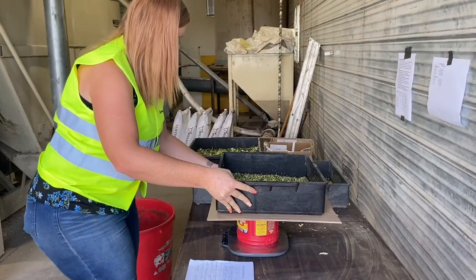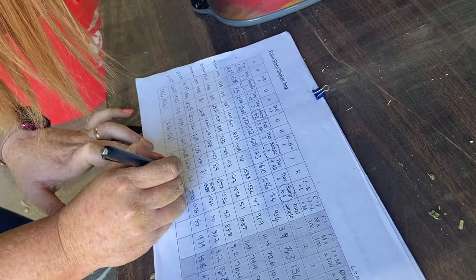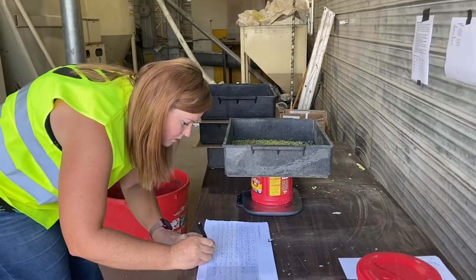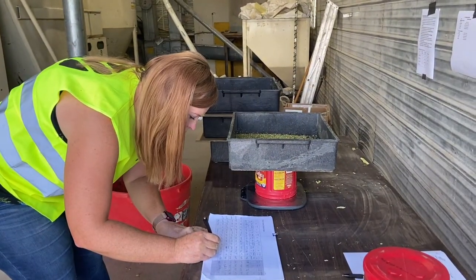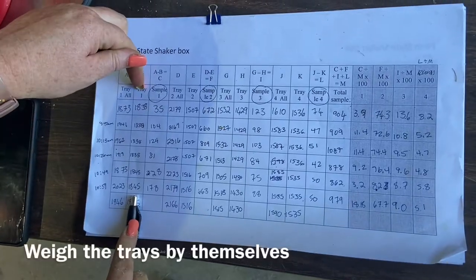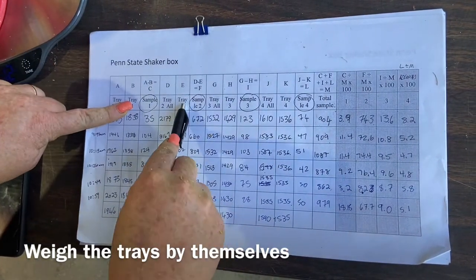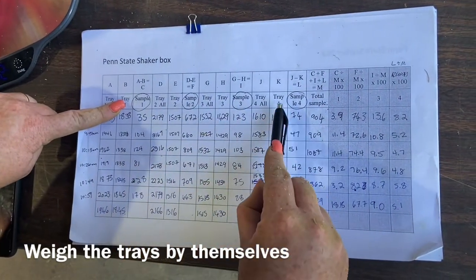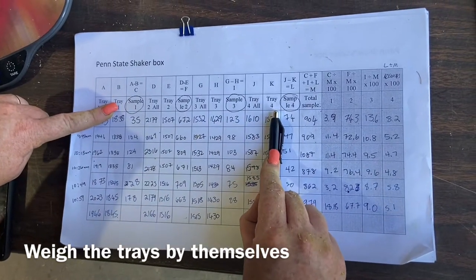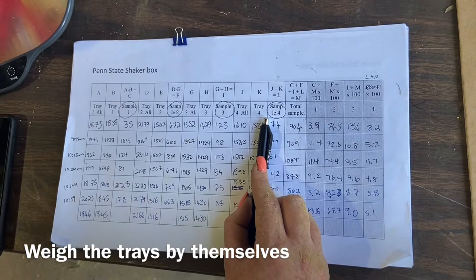Cardboard 3. The last one does not need a cardboard because there's a solid bottom. It's your tray and your cardboard — tray 1 — and you do the same for trays 2, 3, and 4. That's what you weigh ahead of time. We do it every 5 because the tray does get wet and a little sticky.